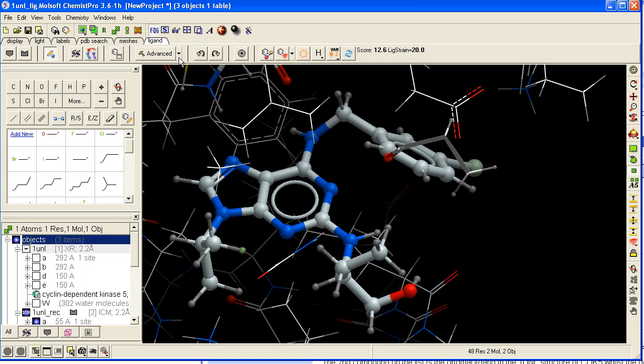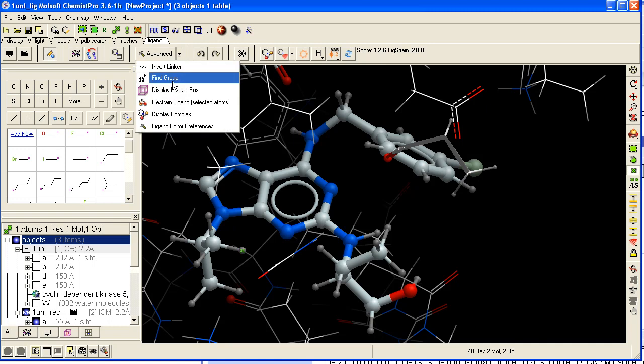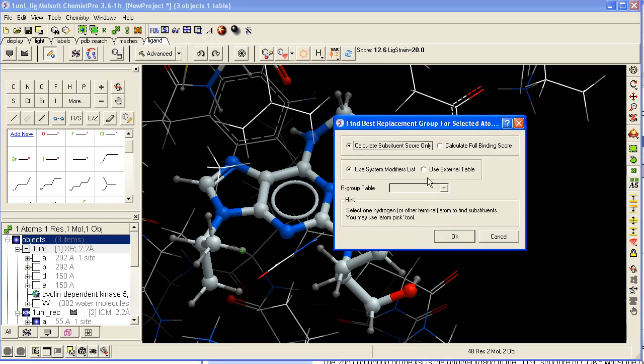Then go to advanced to find group. Then you can choose to calculate the score of the modifier or substituent only, or you can calculate the full binding score.